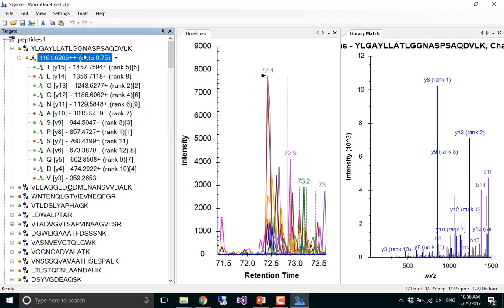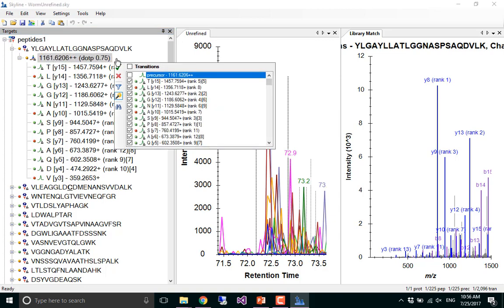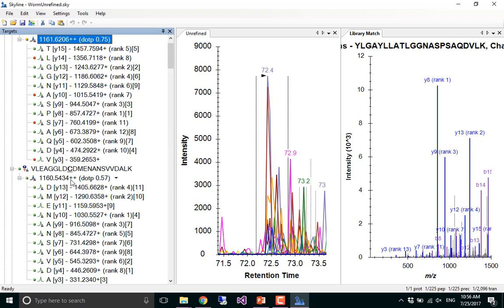If you've got this expanded, does everybody understand how to get a list of the potential children? You hover over the element, this drop arrow appears, and then if you slide over to that until it turns to a hand, you can click it, and you get this pop-up. And right now, oh, it's unfiltered. In this case, the instrument settings go to 1,500. So you can't get it, okay, so let's find something else here.